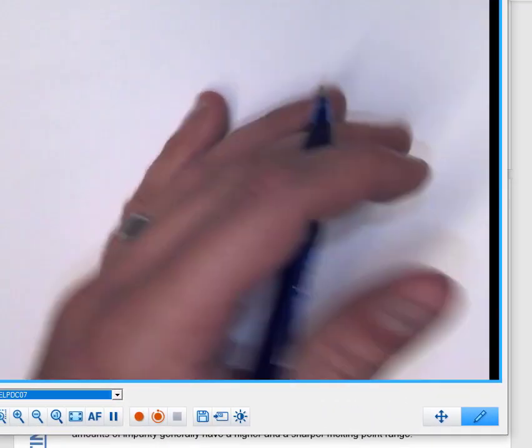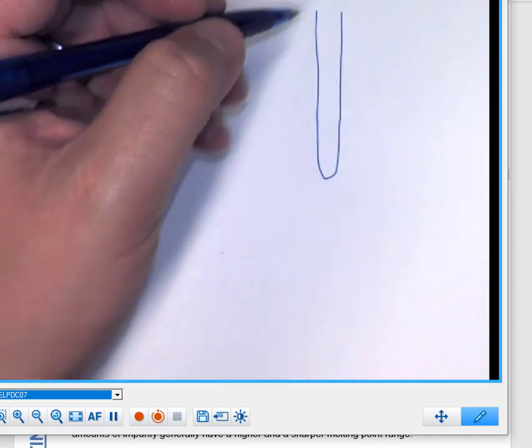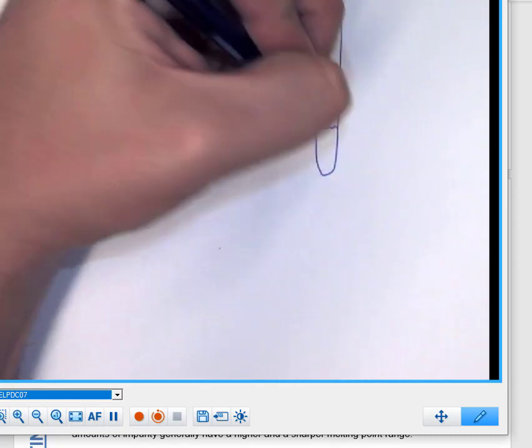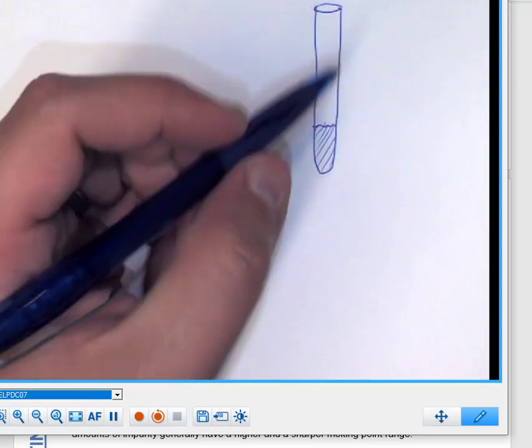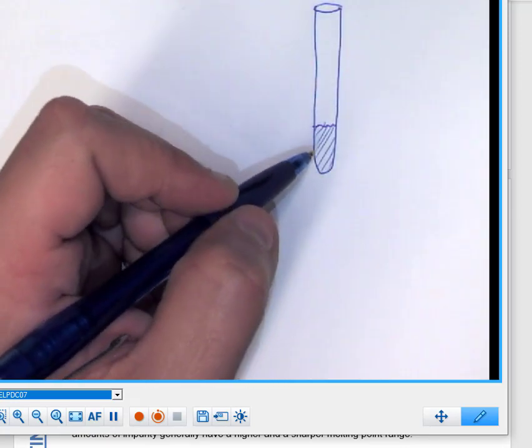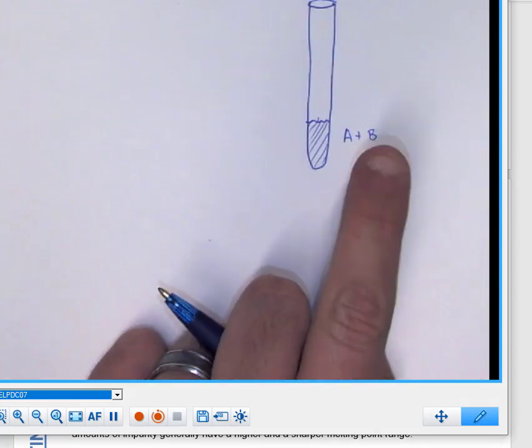So sometimes when you have your little capillary tube, let's say it's got a mixture, it's got impurities. So here's my capillary tube, and it's going to be in the Digimelt. And so let's say you've got a solid, right? So all of that's a solid. Now it doesn't really look that great as a solid, but it looks homogeneous. Let's just say it looks like a regular white powder, but there's both compound A and B present here.